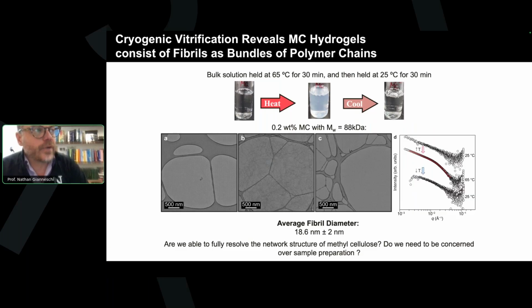The origin of that question really comes from the physical reality of making the sample, and that is that you've formed the gel in bulk, and then you've no doubt disrupted and sheared it in order to study it by the cryo method. Not, of course, that you've cooled it, this is an instantaneous cooling process, but rather that you've processed the sample in some way. It may be cooling and breaking up, but it's certainly being destroyed in order to make the micrograph that's then imaged in B. And this would be true for other kinds of materials.